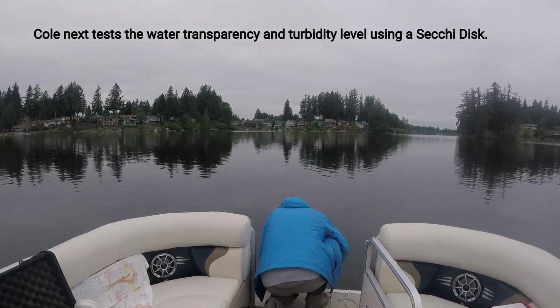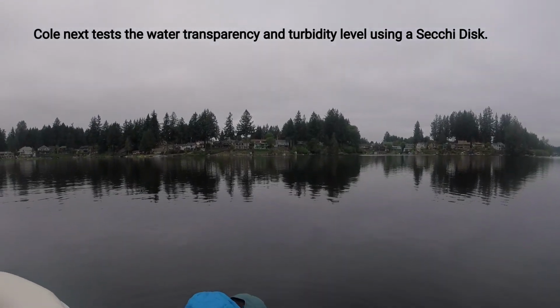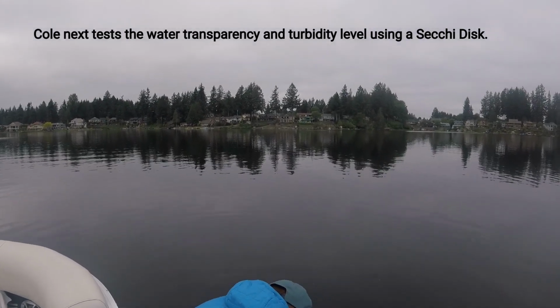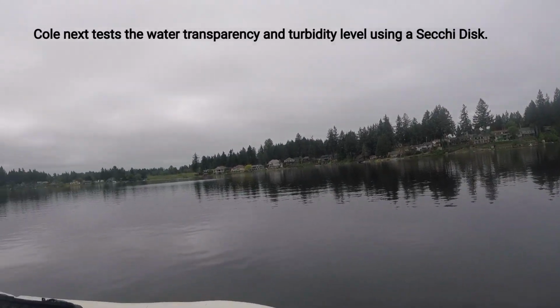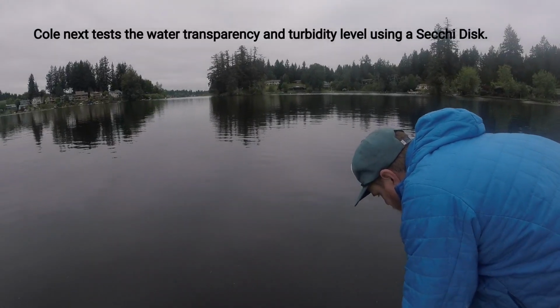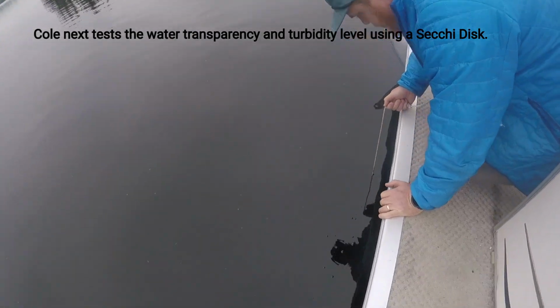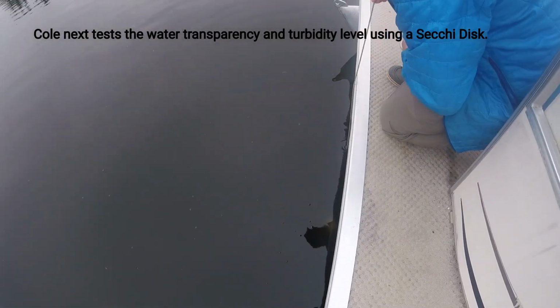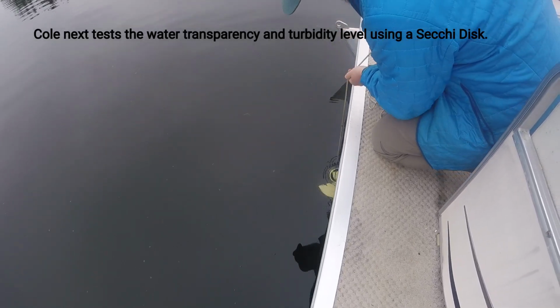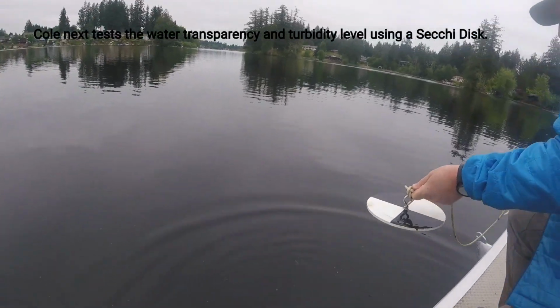Cole's doing the Secchi disk, which gives you water transparency or turbidity. He's going to lower it down till he can't see the disc and then read the depth, and bring it up to where he can just barely see the disc, and get the distance. 10 feet? Yep.